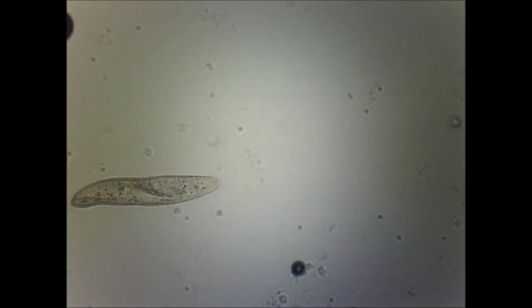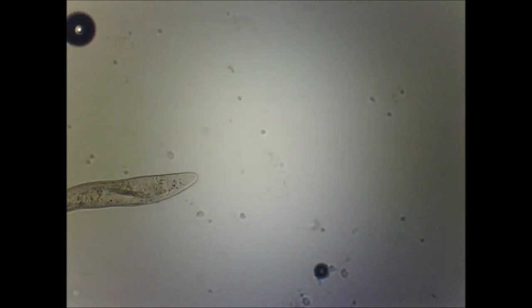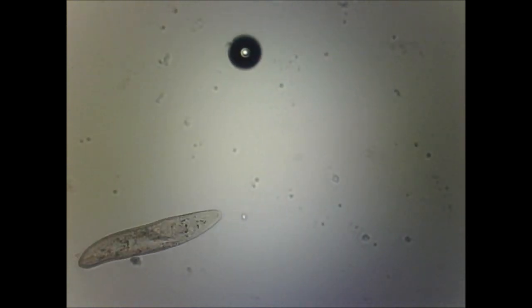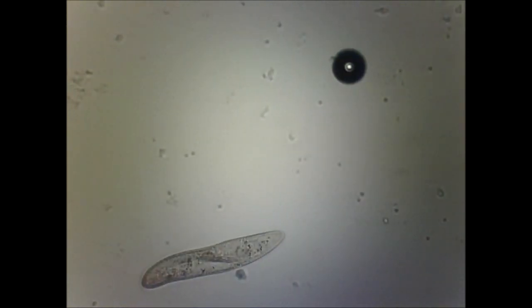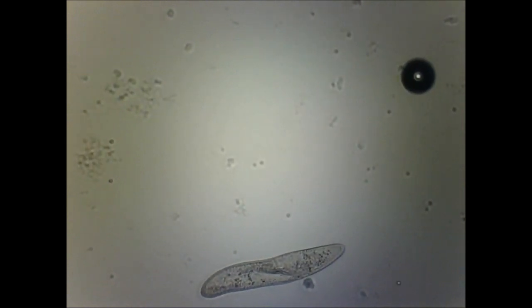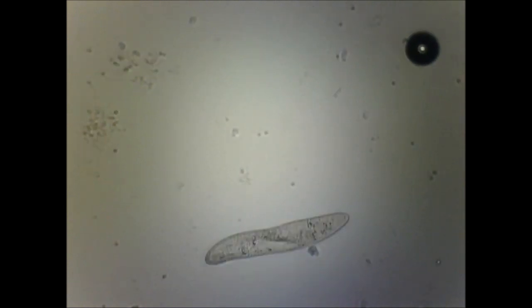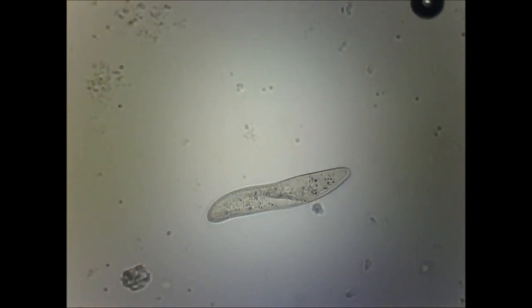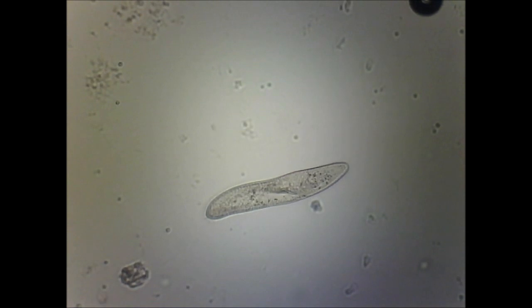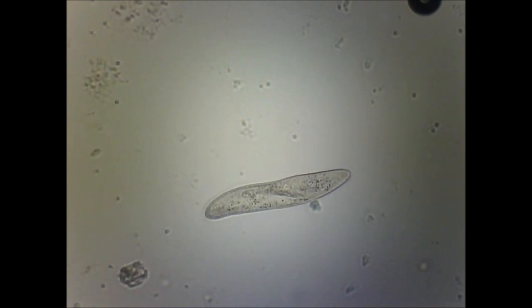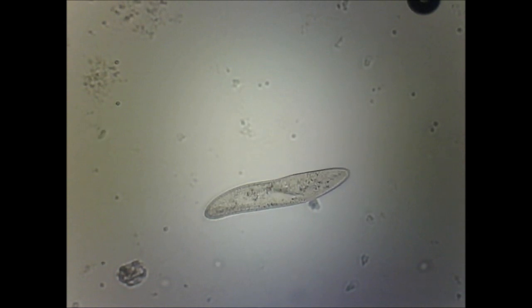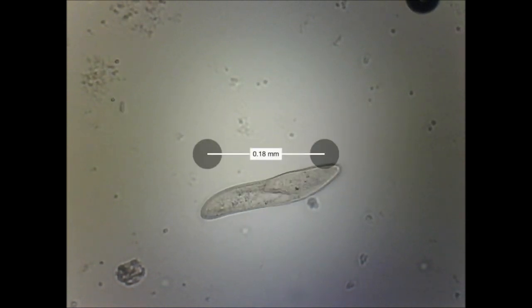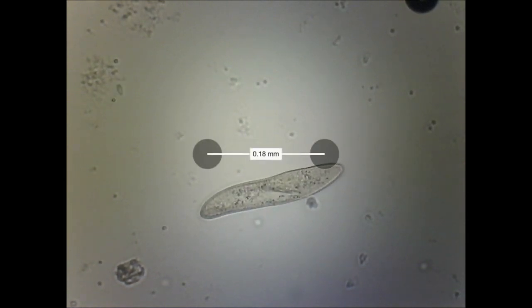Here you see a single paramecium in this methylcellulose, which is kind of gelatinous, so it's harder for it to swim and it slows down. As you look closely you can make out some of the detail inside the cell, even at this medium power magnification. You can see cilia beating on the edges and cytoplasm streaming inside — already a much better view.